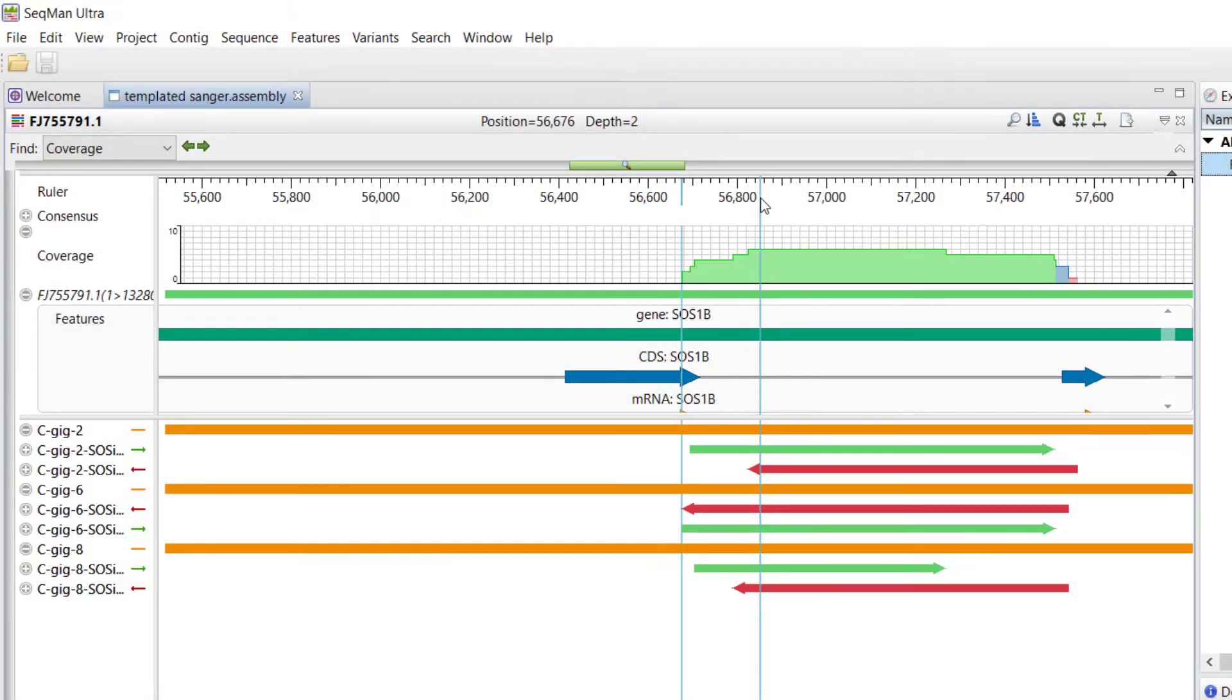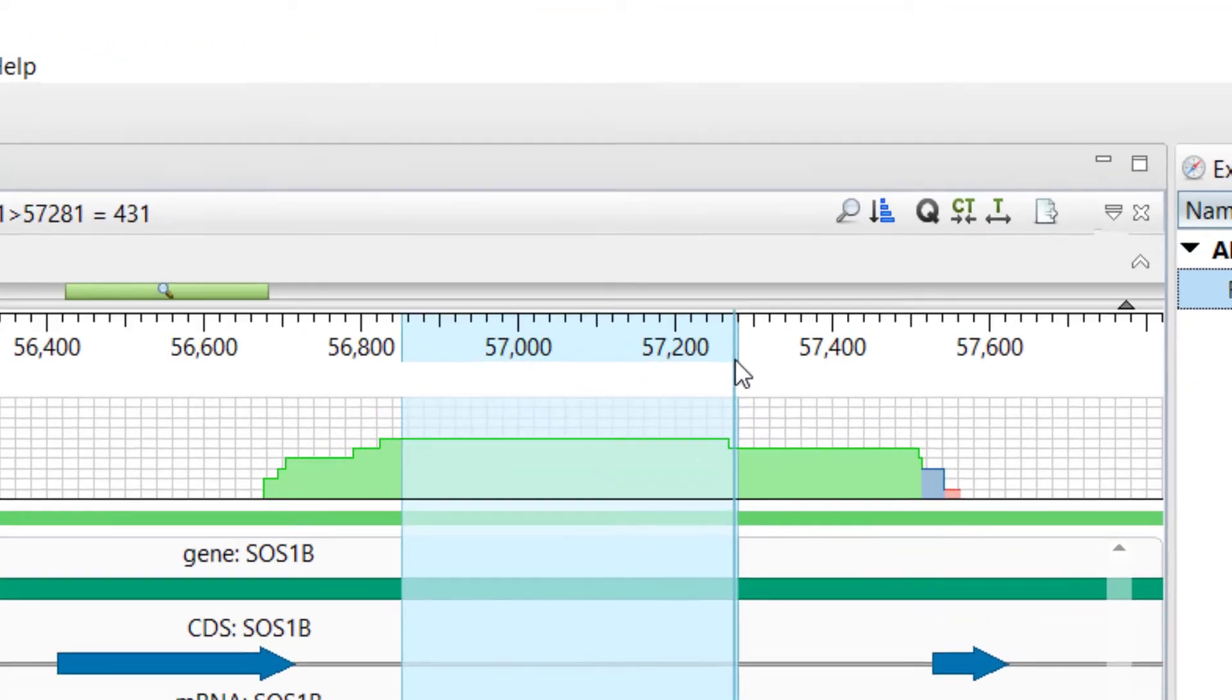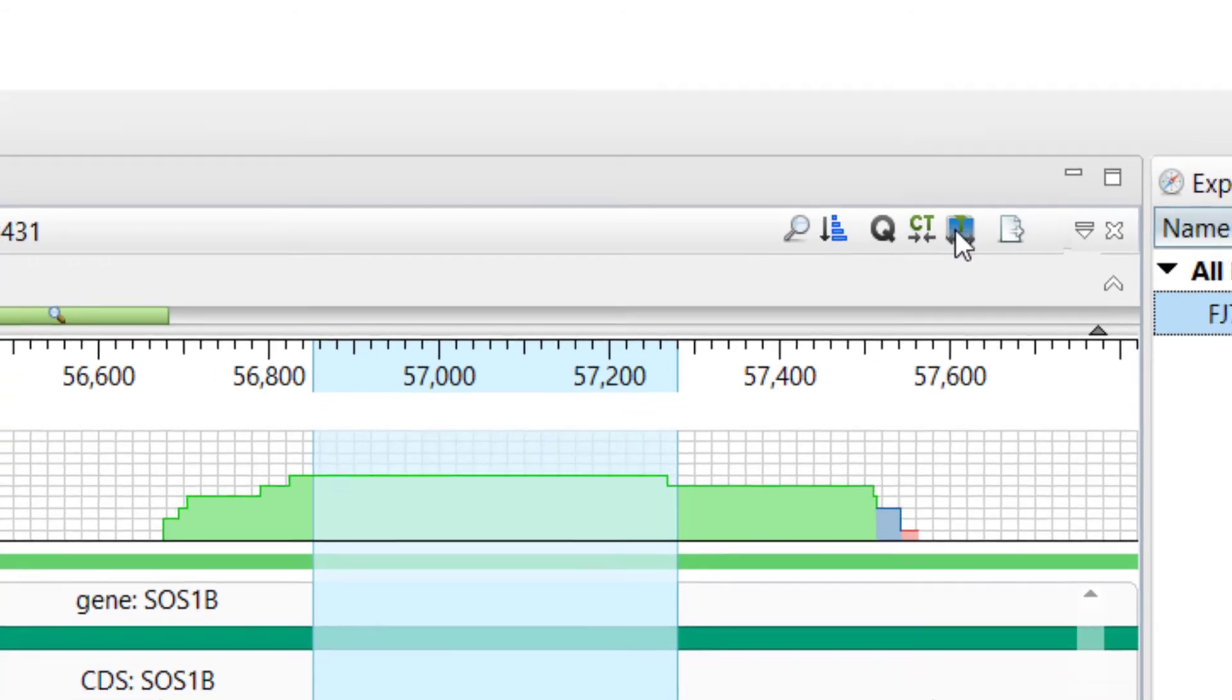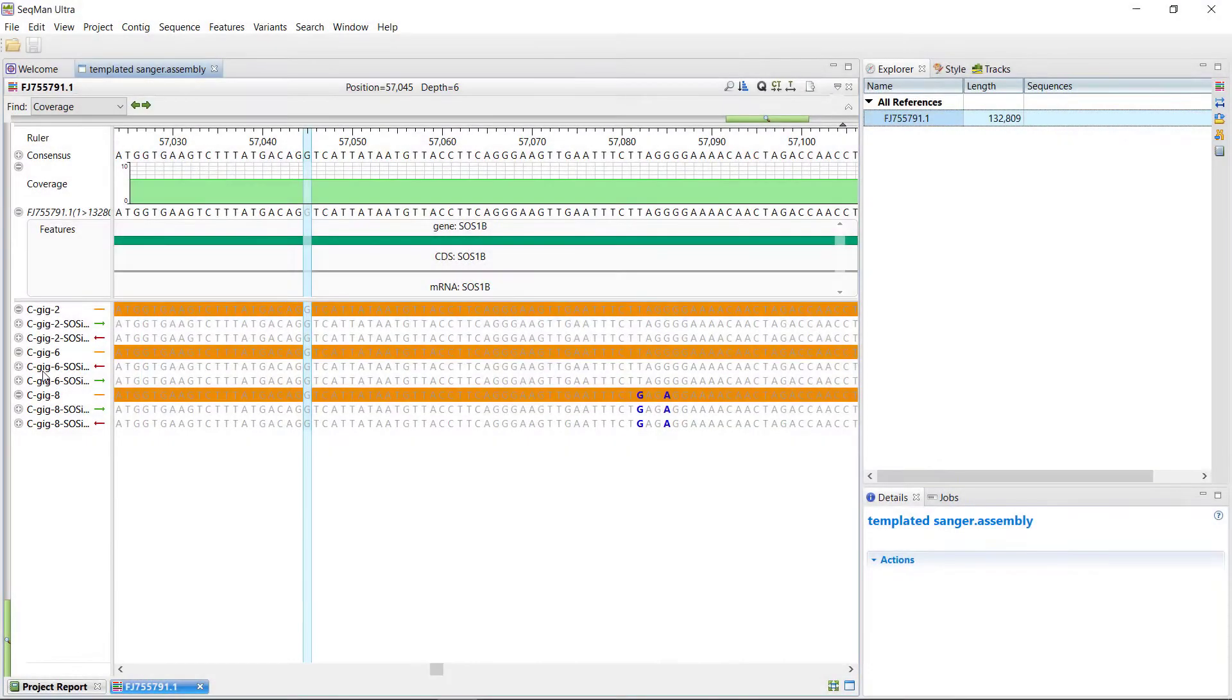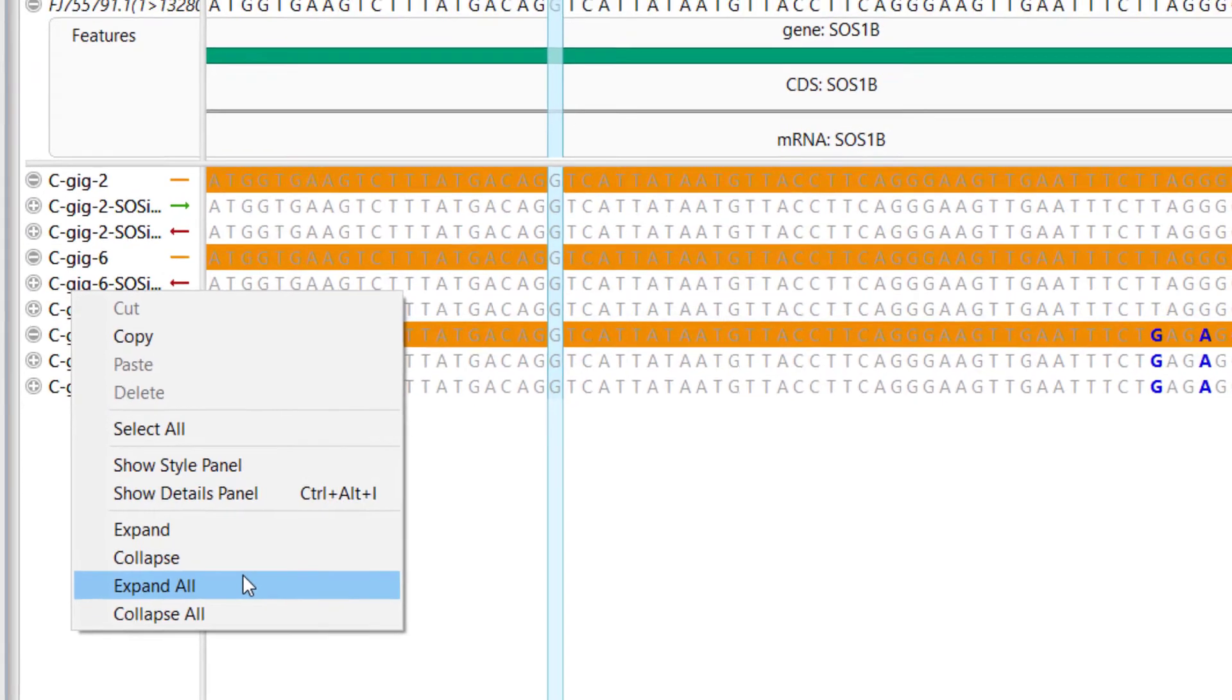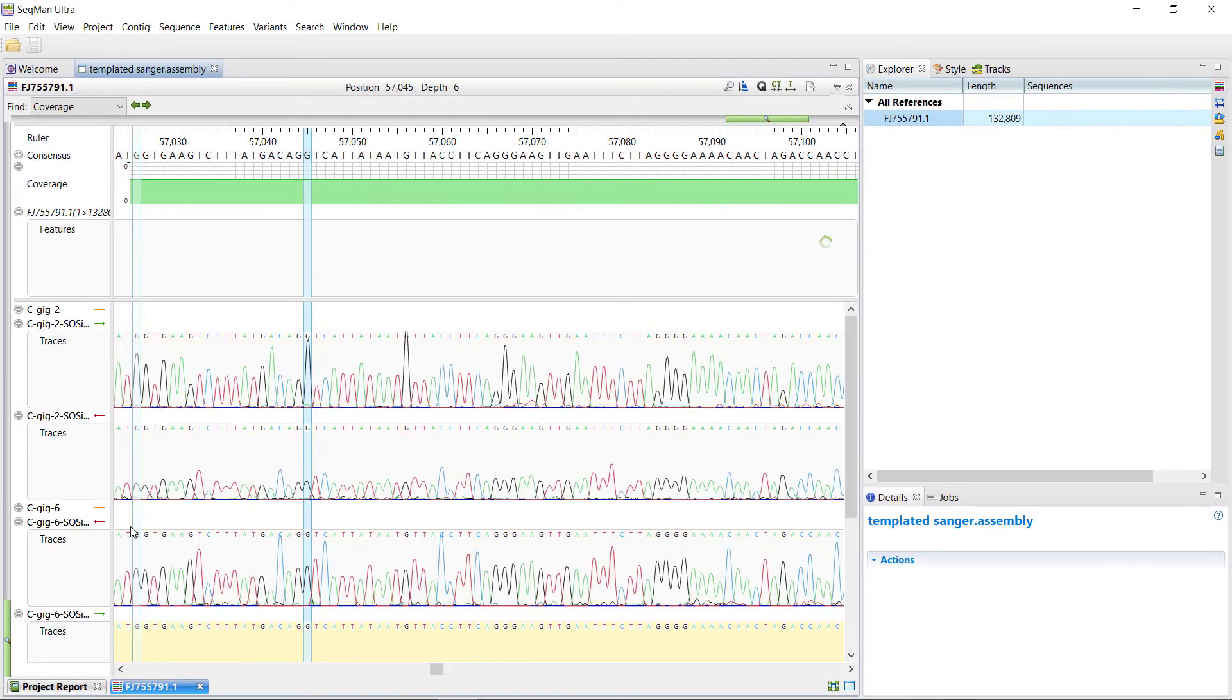For an in-depth view, select a region in the alignment, and then use the Restore Default Zoom tool. By right-clicking on any sample name on the left, you can expand trace data for one or all samples.